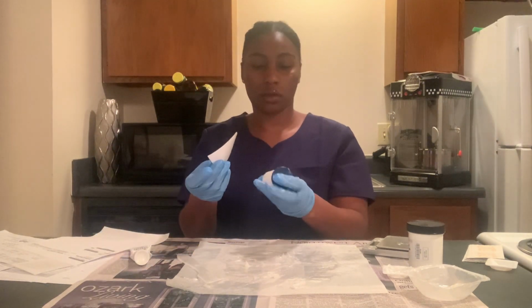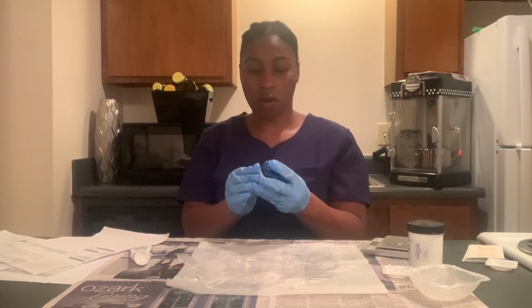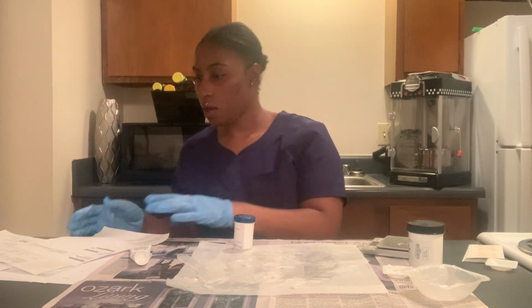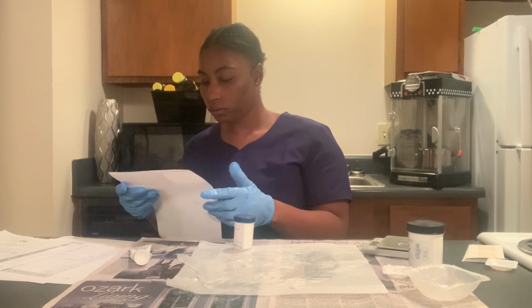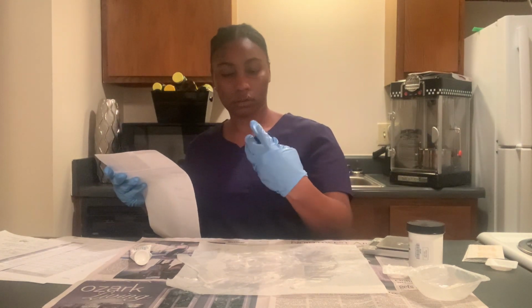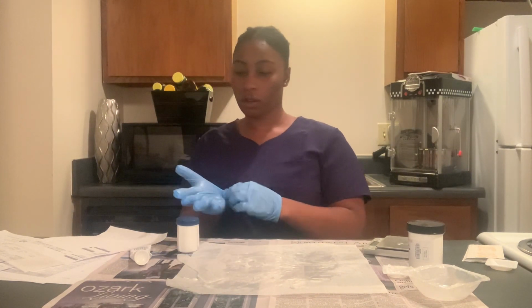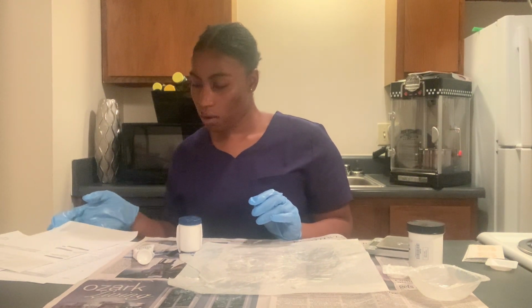I'll put it on the bottle. Okay. So you'll put it on the bottle.